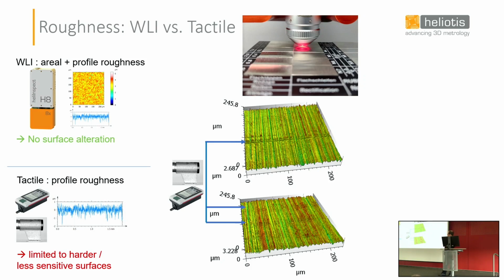And actually you can measure out pretty much where the tactile instrument went along. It's even more surprising if you consider if I now read the result from the tactile instrument, it corresponds pretty exactly to what the roughness standard says. However, that's very untrue.